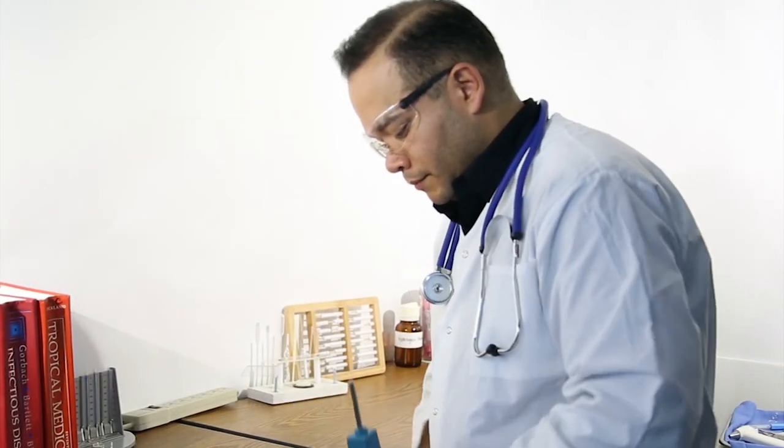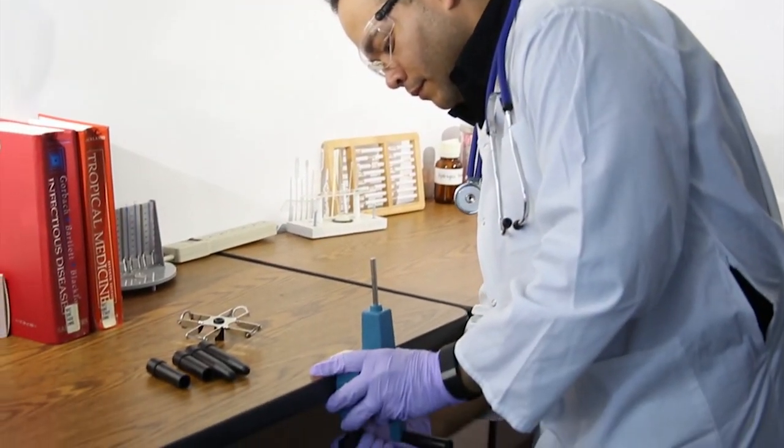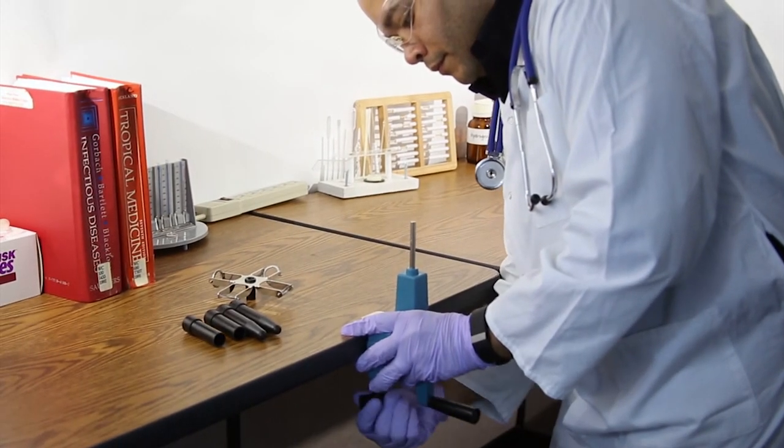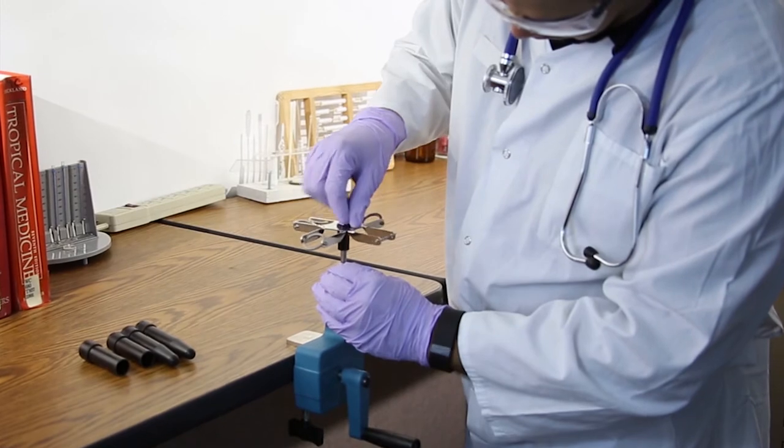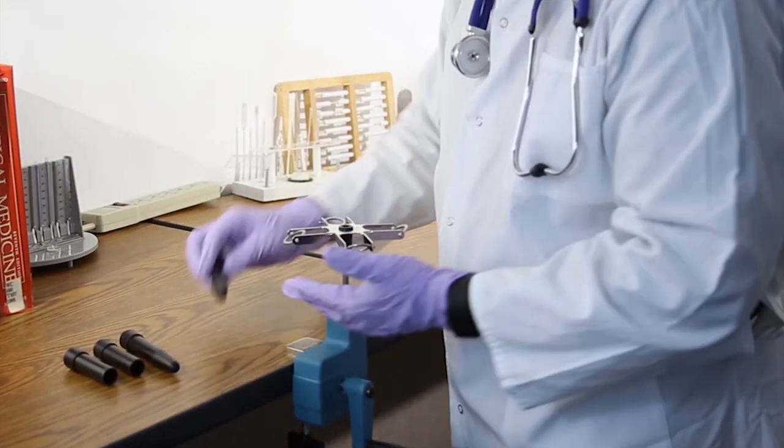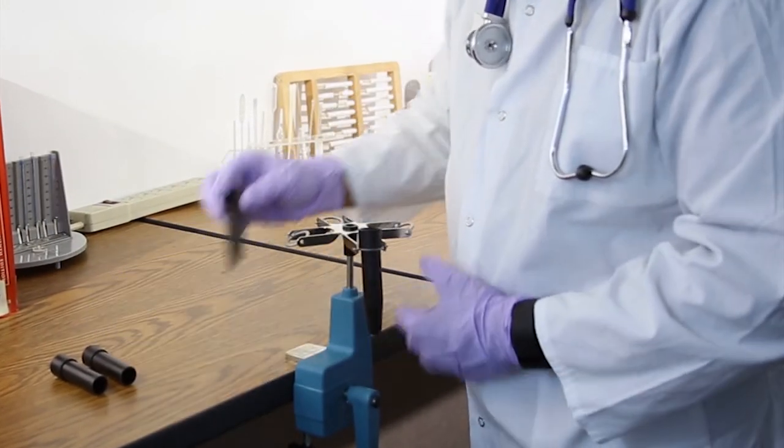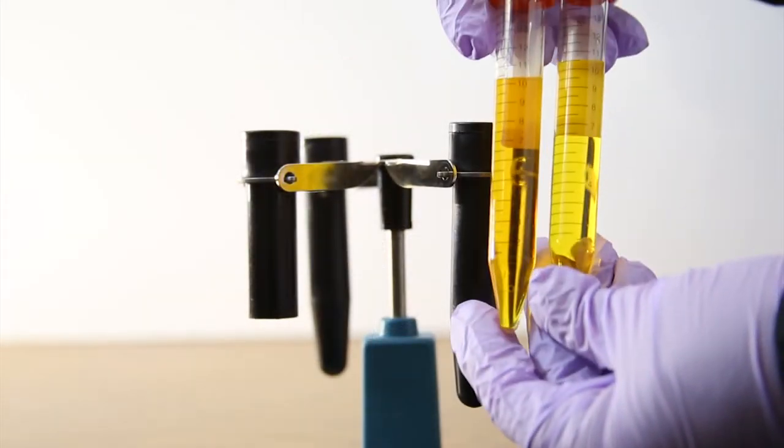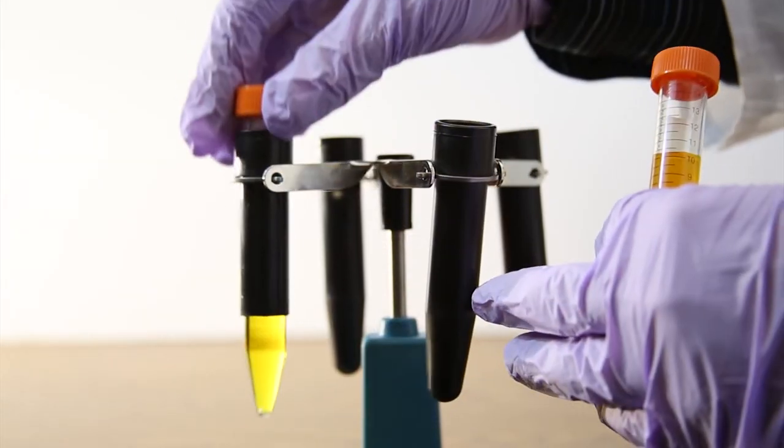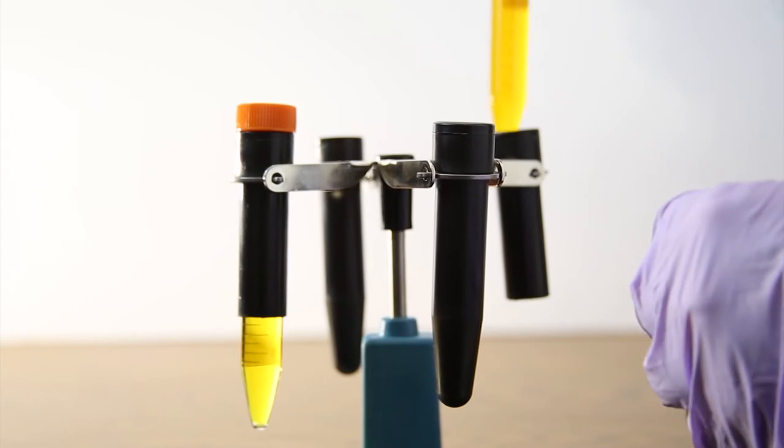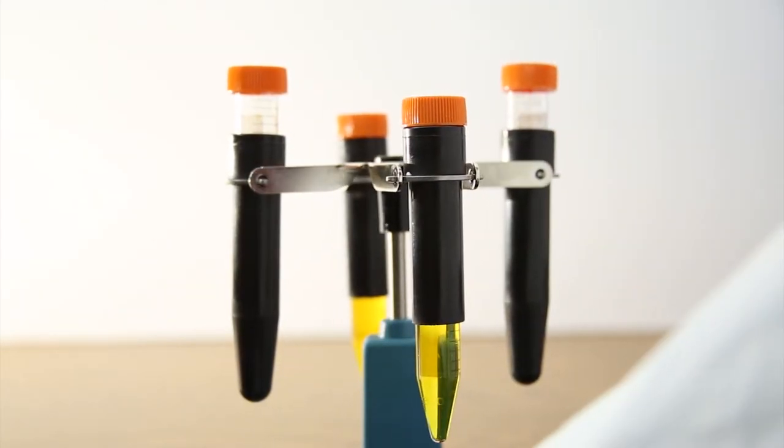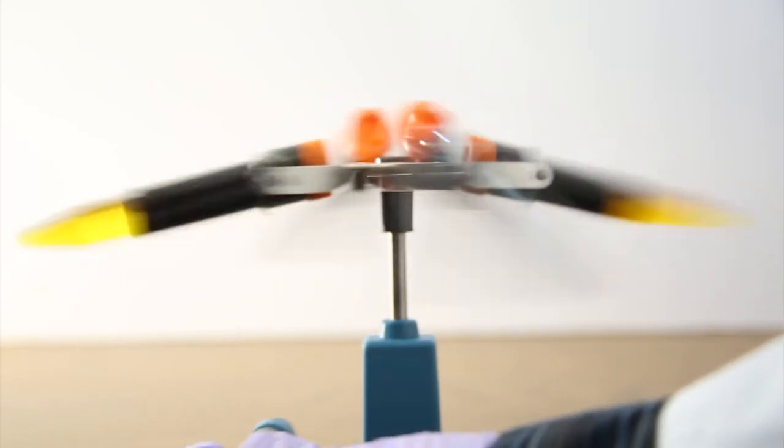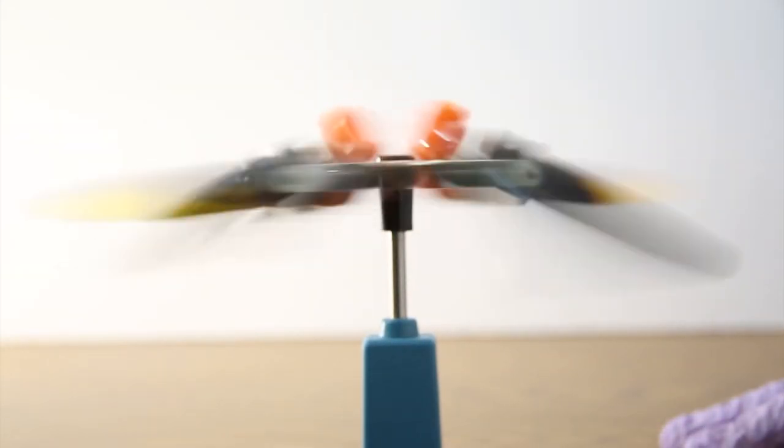To operate, secure the centrifuge to a solid support such as a table with the clamp. Slide the centrifuge head over the shaft until it clicks into place and place the black tube holders of like shape opposite each other. Be sure that each tube contains equal volumes and is balanced opposite each other in groups of 2 or 4 to prevent unwanted vibration. Crank at the specified speed and time to achieve 105 turns per minute for 5 minutes.